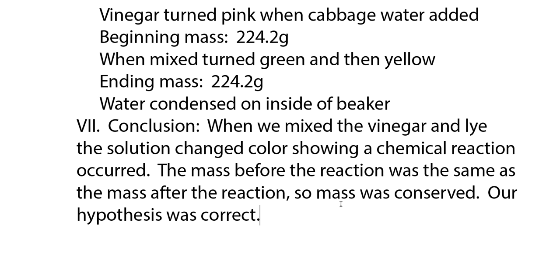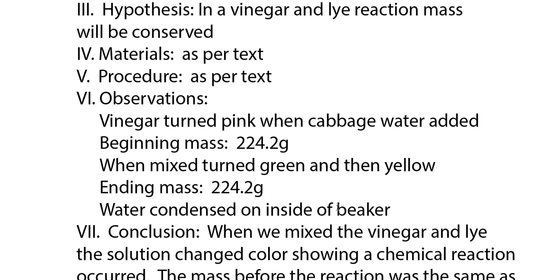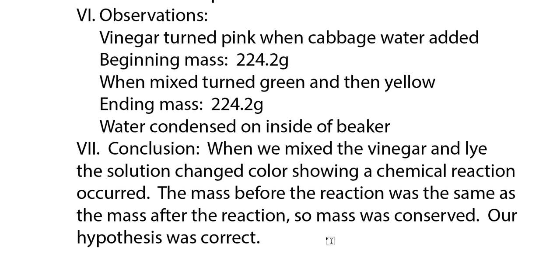Okay, so that's the end of this experiment. If you wrote down this entire experiment in your lab notebook and you get it to me, it's an easy 100% right there, so good for you. Okay, so that ends the law of mass conservation. Hopefully that helps you understand a little better.